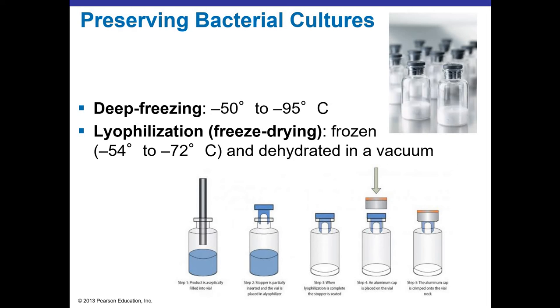Although we're talking a lot about growing bacteria, we don't want to keep them growing all the time. That would take a lot of media, a lot of effort, because you have to keep giving them fresh media, keep transferring them over and over again. And the bacteria themselves may actually not like that and may not do well after you've passaged them a number of times. So therefore, we often want to preserve bacterial cultures so that we can store them and come back to them later.